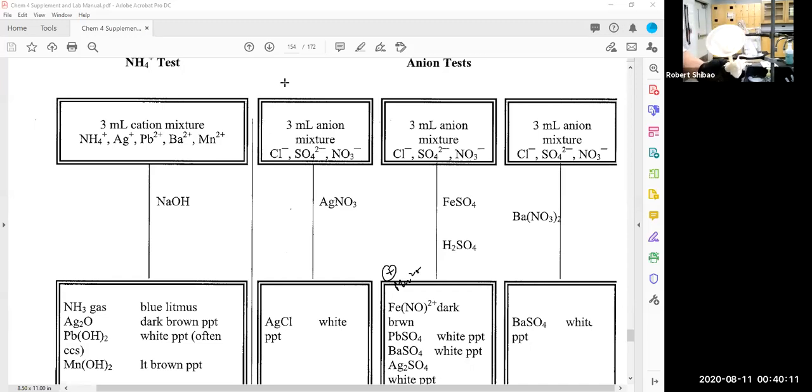Okay, so I have this. Normally you don't want to handle these with your fingers, because there could be stuff on there. So you get a spatula and you scrape the filter paper out with a spatula. Sometimes we need to keep the precipitate. Sometimes we can throw it away. In this case, we'll just throw it away, but we'll try to look. It looks like there's a white, kind of silver, kind of gray precipitate in there.